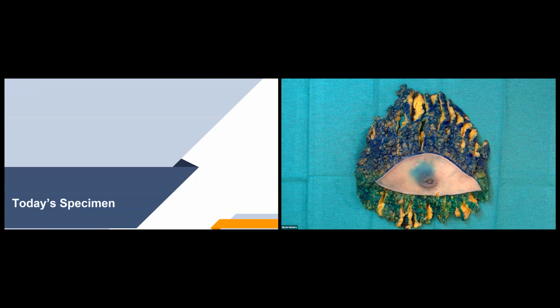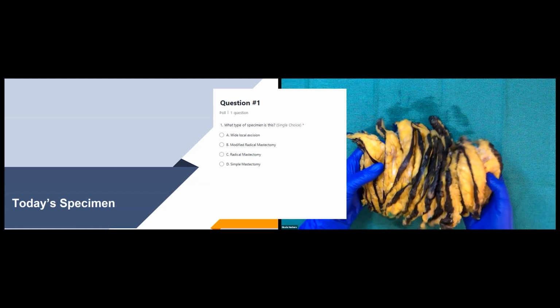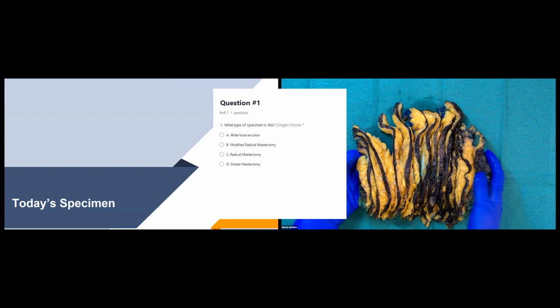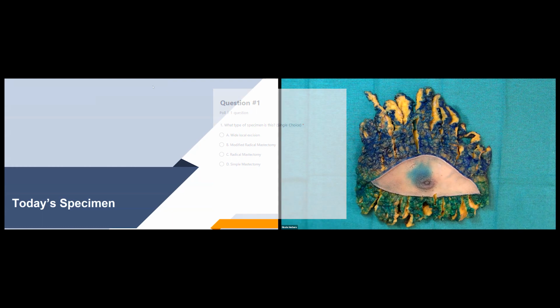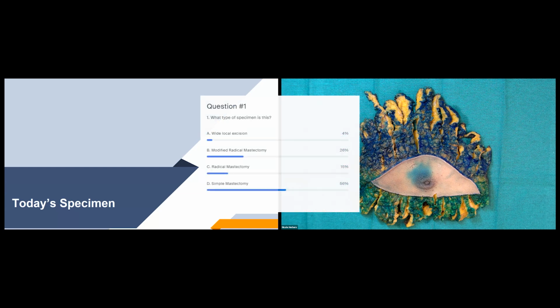And I'll put up our first polling question now. What type of specimen is this? Okay, and I'll end the polling there. So the correct answer for this one is in fact a simple mastectomy specimen. So it looks like the majority of you got that correct.